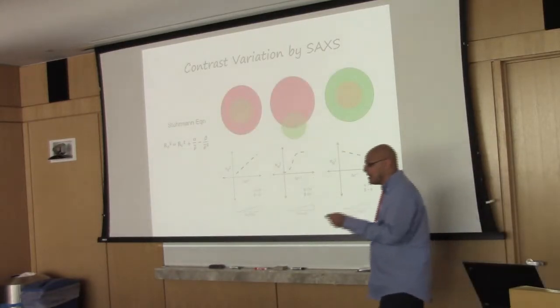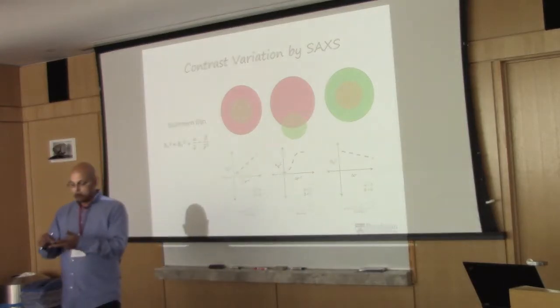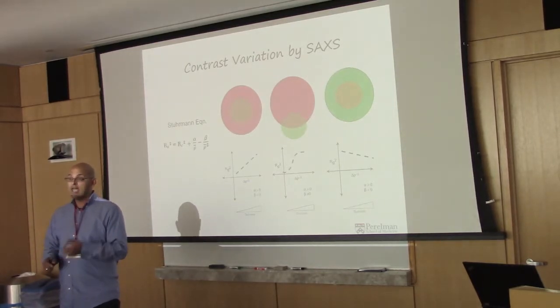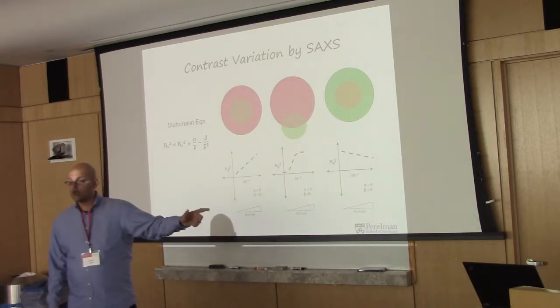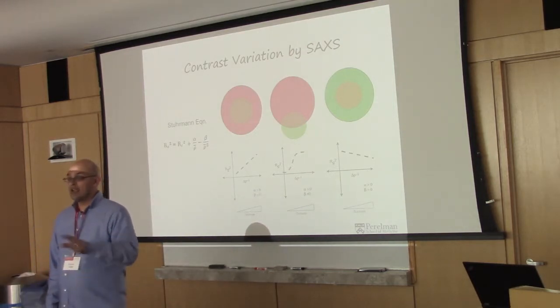Not everything can be done by neutrons. That can be because you don't have enough sample quantity, or you don't have access to neutrons. Doing neutron scattering is difficult in practice. You have to be patient because there are only two sources here in the U.S. that are really appropriate for biological SANS. That is Oak Ridge National Labs, which has two reactors, and the NIST Center for Neutron Research in Gaithersburg, Maryland.